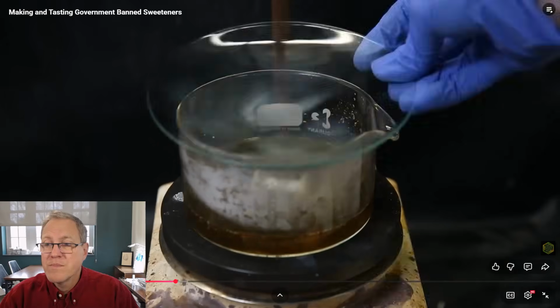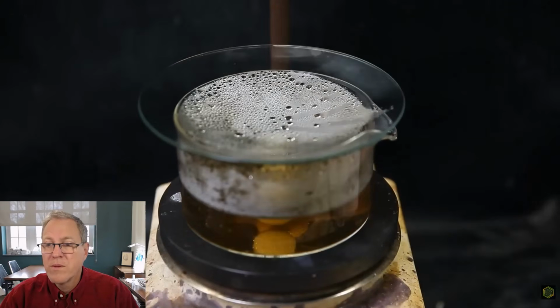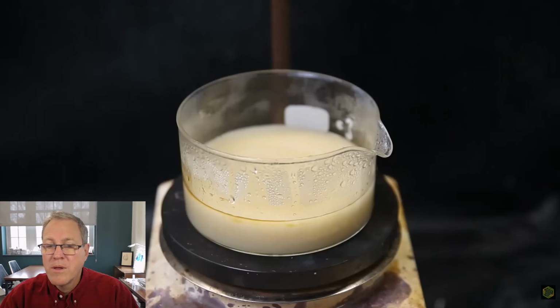I also add some extra water at the end, right up to the point it barely starts to precipitate out again. I then move the dish to the fridge to cool it down. After that, it had become milky.